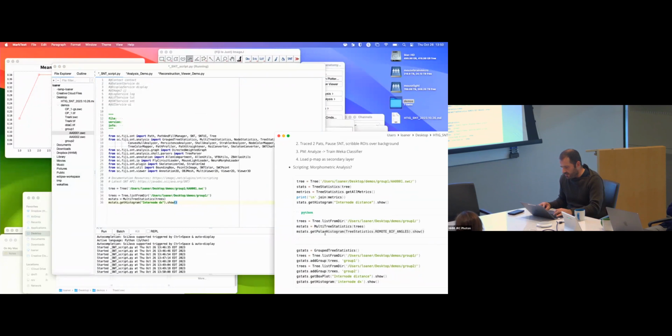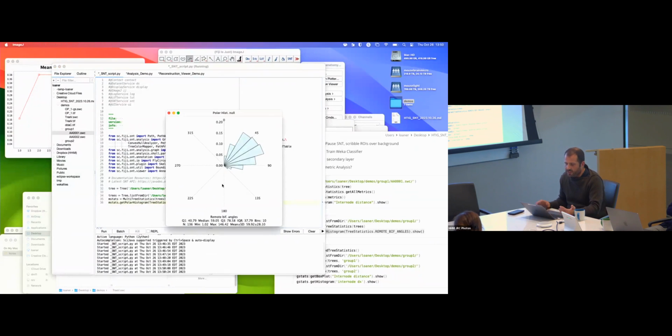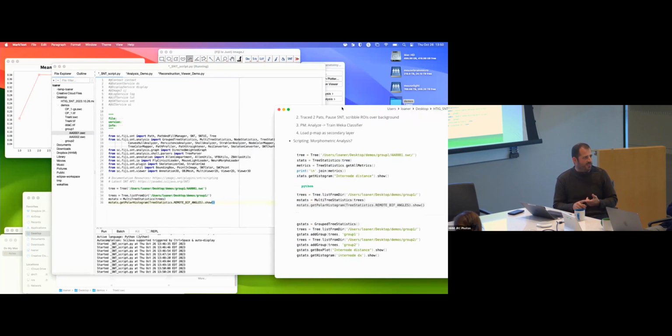We use this for angles. The idea is that with minimum effort, you should get some reasonable outputs. And this was a direct answer to Adam Taylor, who's always saying that he uses MATLAB because MATLAB just makes things nice out of the box. And like, duh. Anyway.